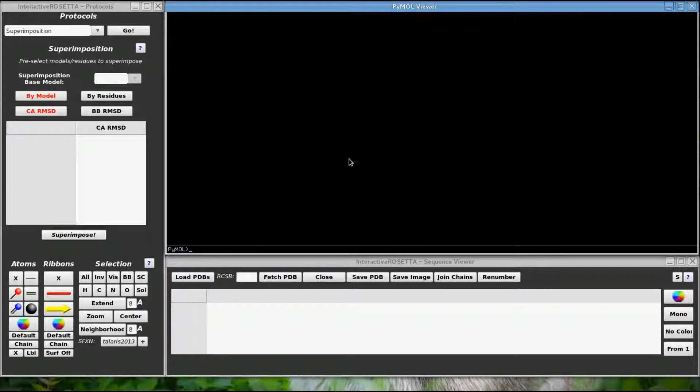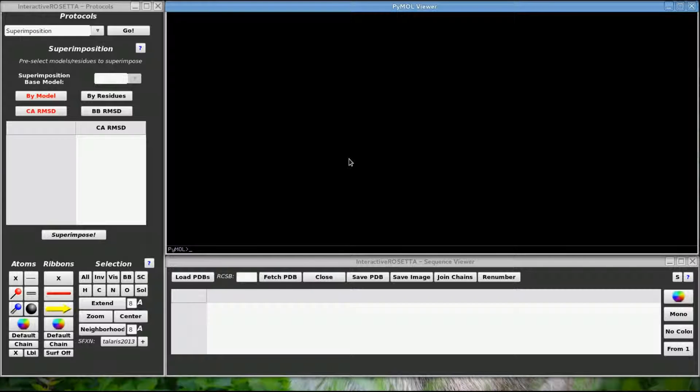Welcome to another Interactive Rosetta tutorial video. In this lesson, I will teach you how to use Interactive Rosetta selection and visualization tools to manipulate your structures more easily prior to running Rosetta protocols.